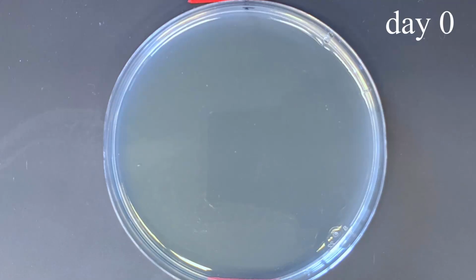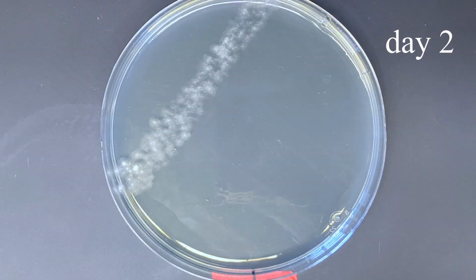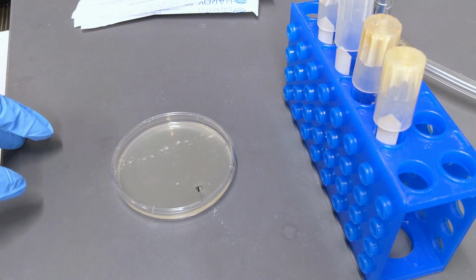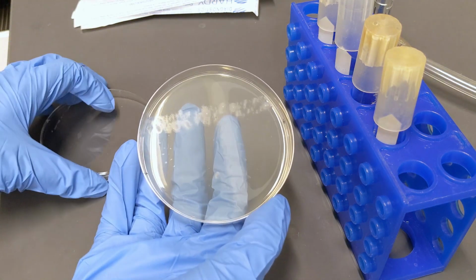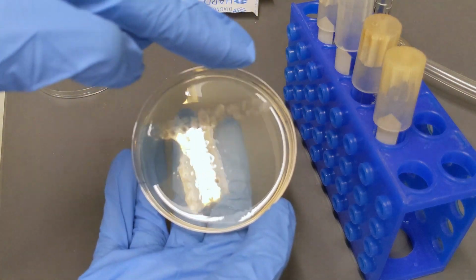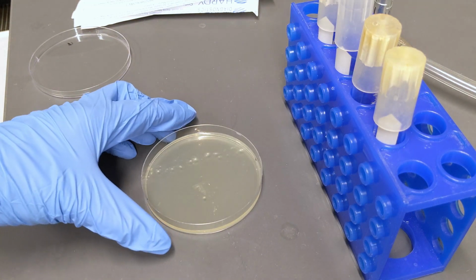Two days later, we see a P. rubens colony on the inoculated area. Then, we will use a sterile cotton swab to inoculate the agar with 4 different bacteria strains, including 1 E. coli strain and 3 S. aureus strains.